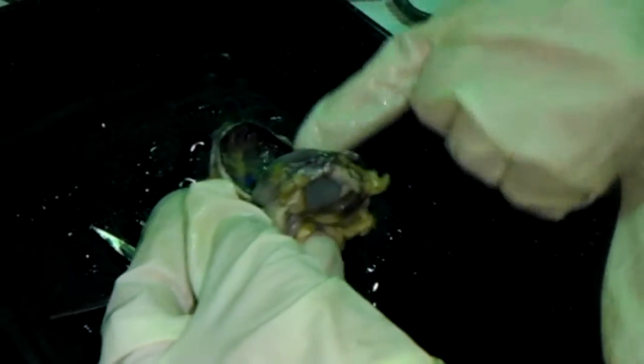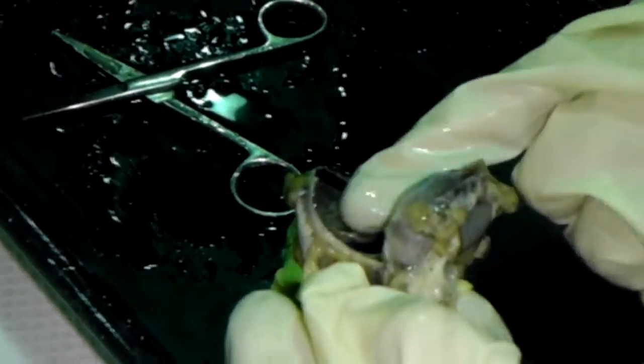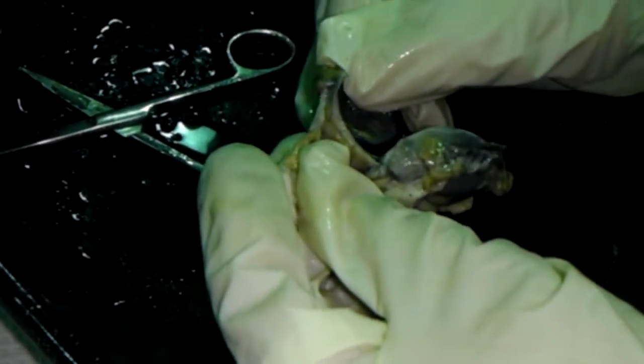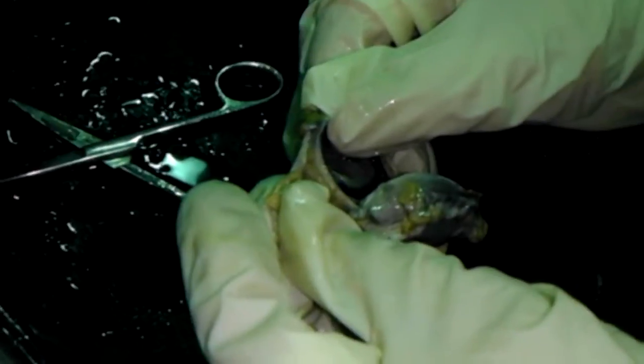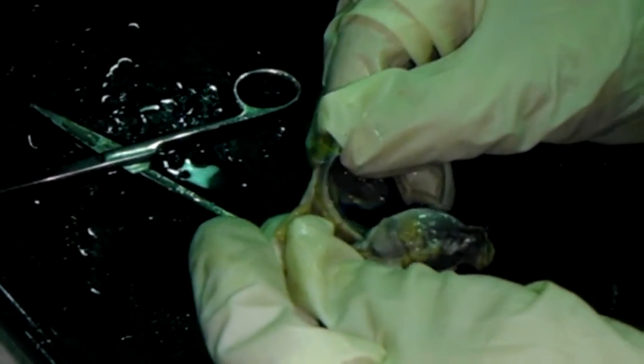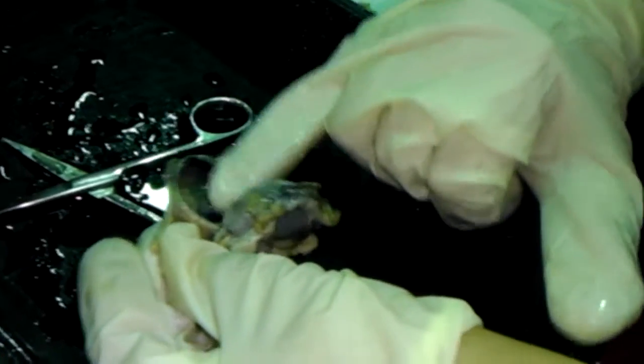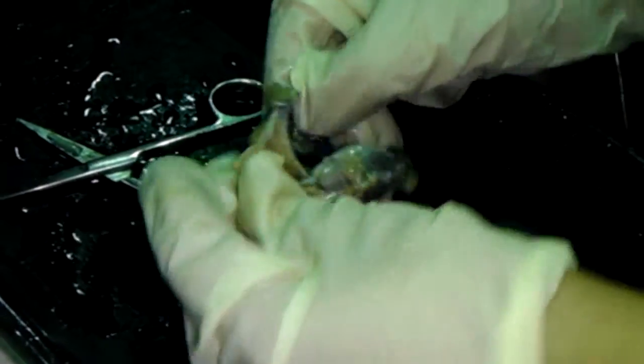And when you look inside the eye, you can see the retina. So what you have here, guys, is the retina. Can you see the retina, this innermost layer here? Is this the blue part? No, the blue part is the choroid. Wait, do you want to sit down? Don't fall down on me, okay? I cannot hold you. So this is the retina, right? And what you have here, the shiny part, is the choroid.